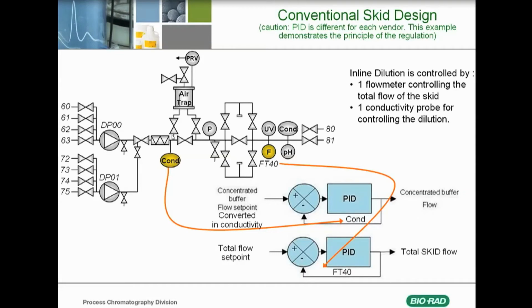We have then a mixing valve, we have a static mixer, and we have a bubble trap that can be bypassed through the valves. Then we have the very famous column block, where you can go downflow, upflow, or bypass. Then you have the instrumentation after the column, and then you have, of course, at least two outlets, one for the waste and one for the good fraction.